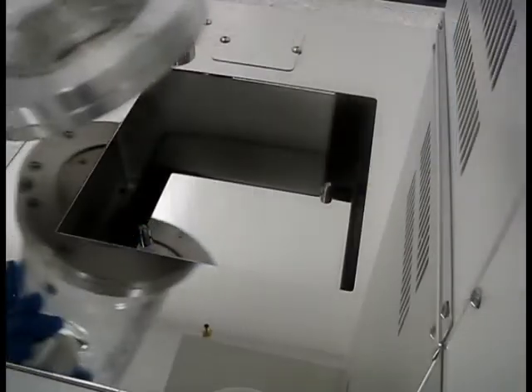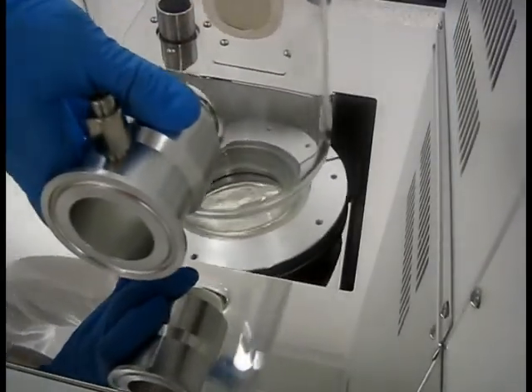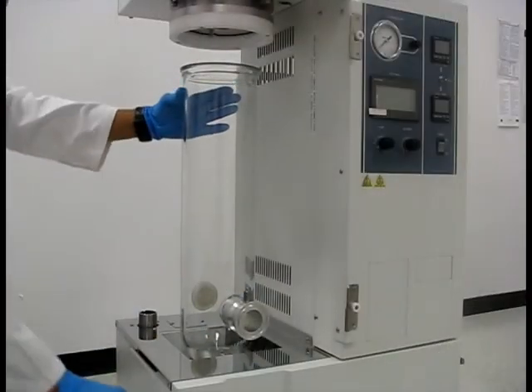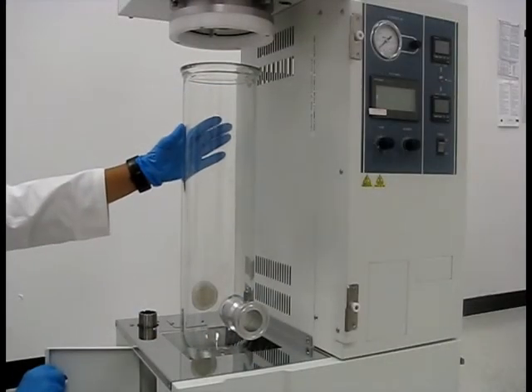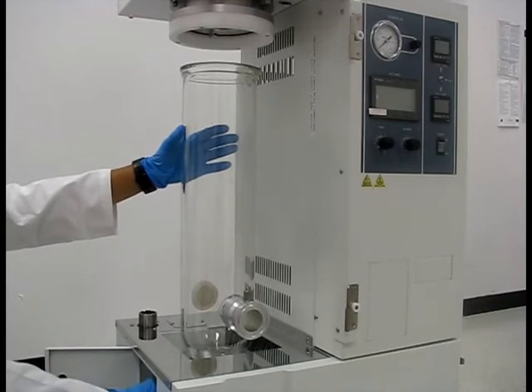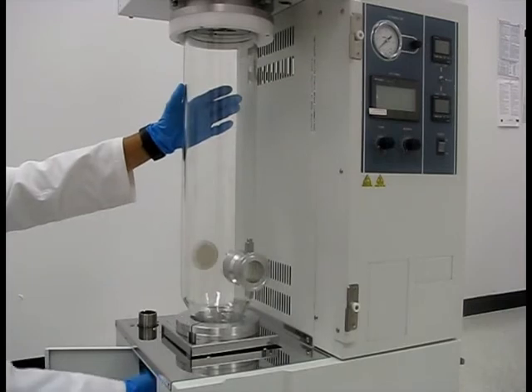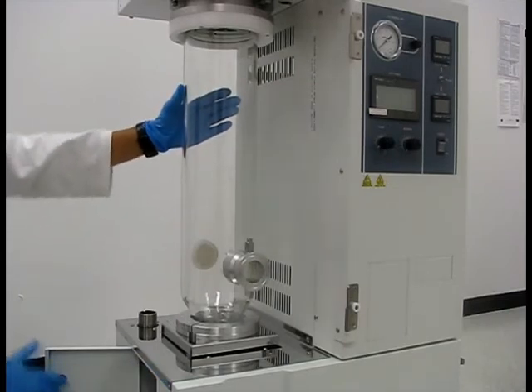Carefully align the drying chamber with the pegs on the stage. Make sure to support the glass chamber while raising the stage. Continue raising until you feel firm resistance, indicating that the chamber is fully in place and properly sealed.